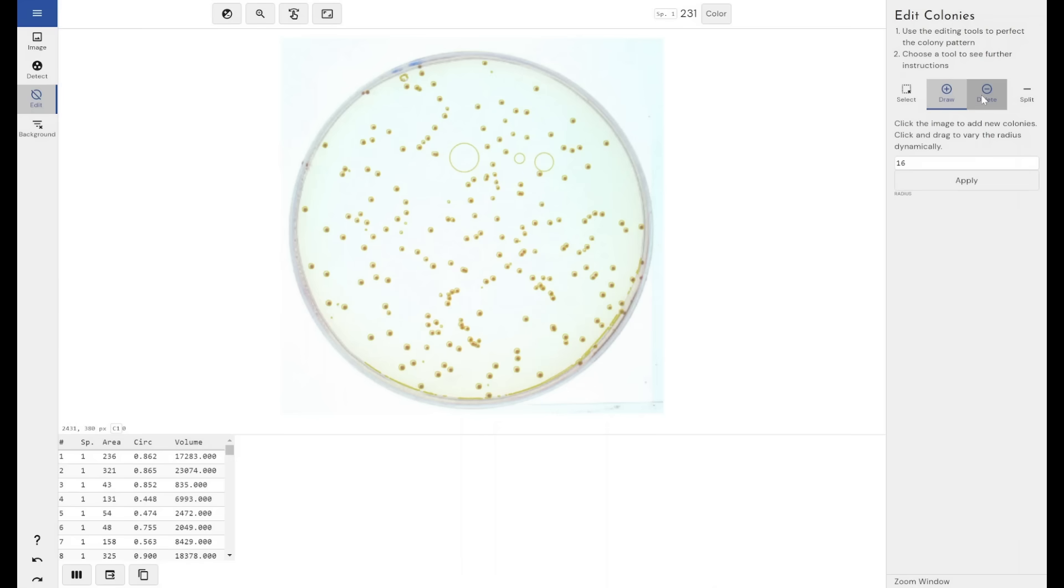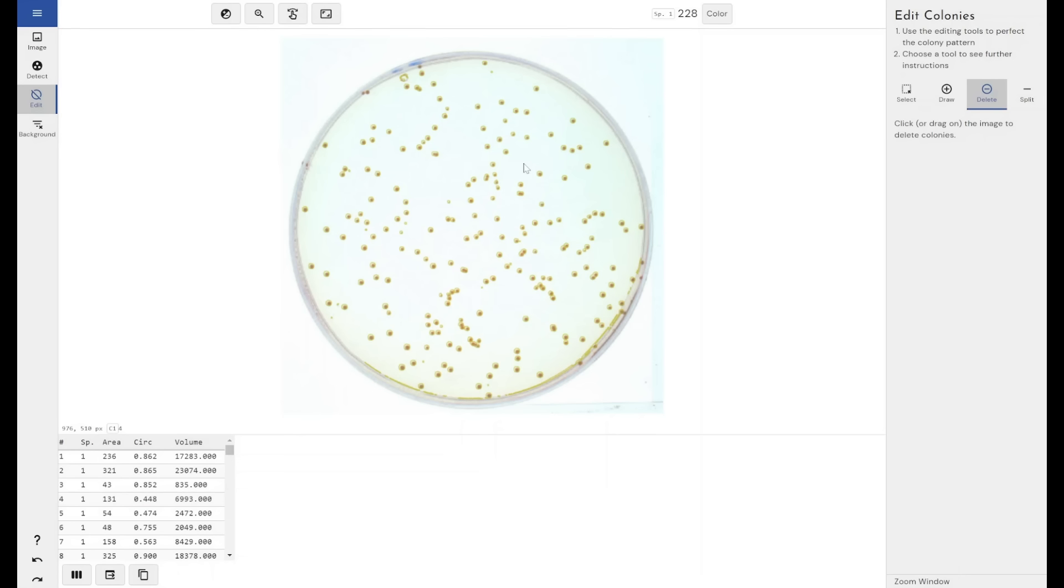And you can delete colonies. If the automatic detection algorithm has detected a piece of debris on your plate or some writing, you can easily come through and delete those from your analysis.